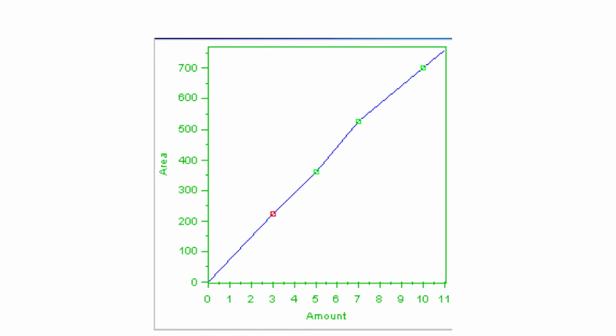Because this curve always passes through the origin, treatments are unnecessary. Because each distinct level is treated independently, data weighting is inappropriate. A typical point-to-point calibration curve is shown in the following figure.